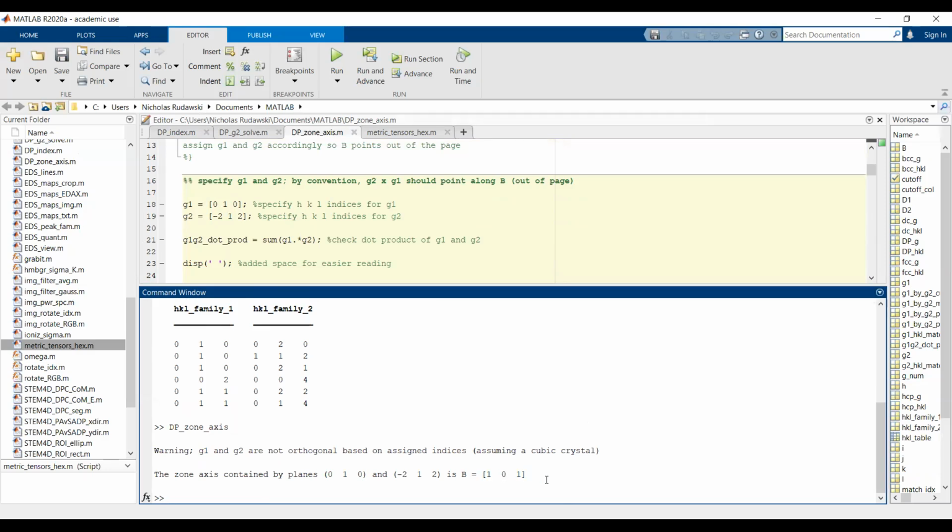And now we need to convert that to 4 index notation. So 1/3 times 2 times 1 minus 0. So we end up with 2/3 for u prime.